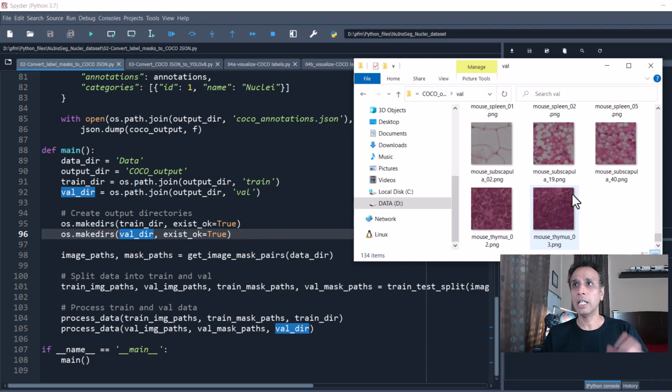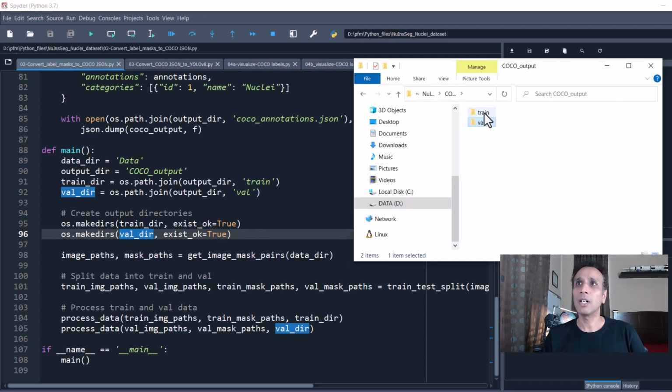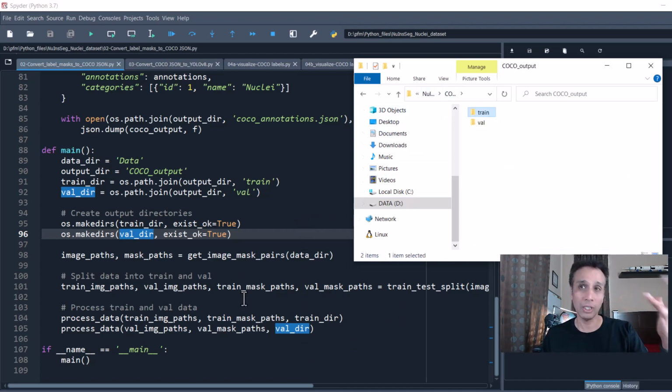By the way, in case you're wondering, what is this guy talking about? I have lots of images here, 533 images in this case, with lots of annotations. It's not just 533 images. There are so many annotations in each of these. I actually took a subset while putting together my code to train Detectron, and I'm dumping the entire data. I don't want to test on the entire data while putting the code together. So please ignore my last couple of minutes. I shouldn't have brought that up, but I was doing that a couple of days ago, so I thought maybe that's the latest situation.